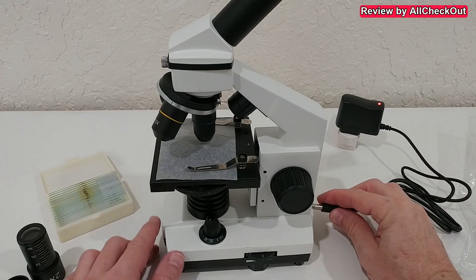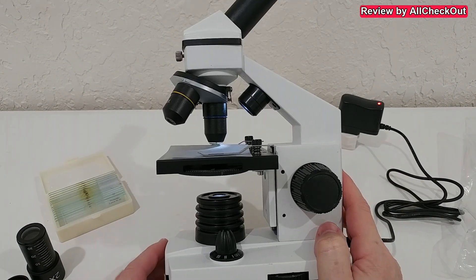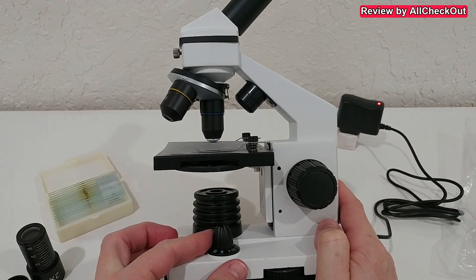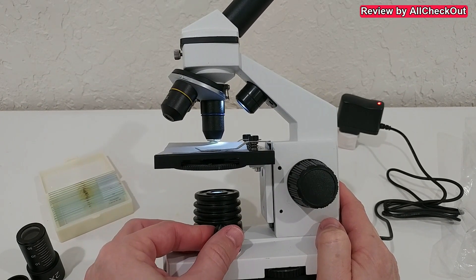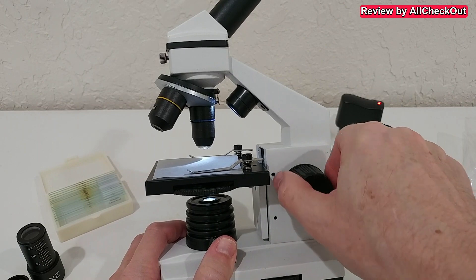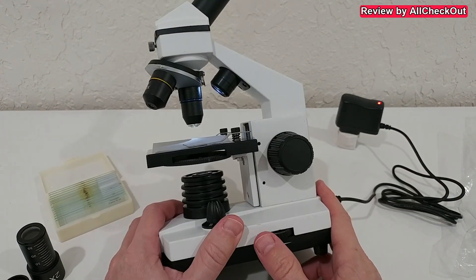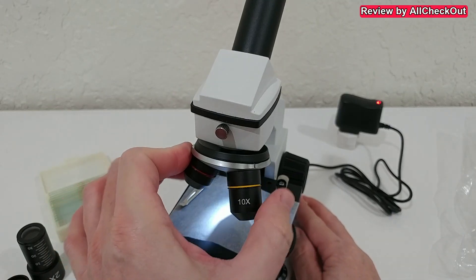We have to plug in the power adapter and then the plug into the microscope. We have the light with two different possibilities to adjust it. With this toggle we can select where the light comes from: off, from below only, from the top only, or from both top and below. Here we have the focus adjustment — it's highly recommended to start with the microscope stage in the lowest position. We can also adjust the brightness here.